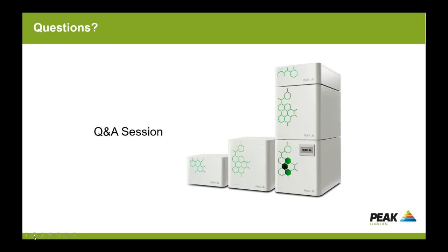But for other setups, it can be as little as a couple of hours to just change the gas and move to hydrogen carrier gas. It's difficult to put a specific timescale on it, unfortunately. But as I said, we do have a number of application notes, and I think if you have application notes or other examples from people who are using the same method as you, then this will help shortcut the process and should enable you to change carrier gas more easily.